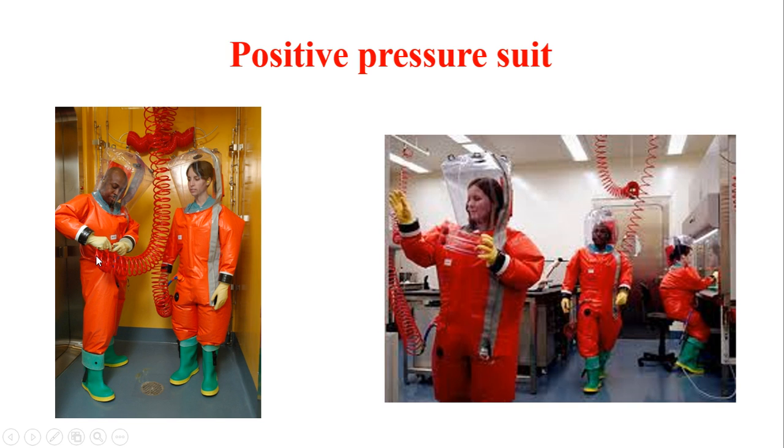So this tube is attached to the suit, and this will start filling the air into the suit like how we are filling a balloon, and it will continuously fill the suit, and there are certain pores in the suit which will allow an equal amount of air to go out from the suit. So air circulation is always maintained inside the suit, and the suit remains swollen, or ballooned. Therefore, even if there is any leakage in the suit, no microorganisms can get inside, because no air can get inside. If there is leakage, air will only go outside. Because of that, microorganisms cannot go inside.